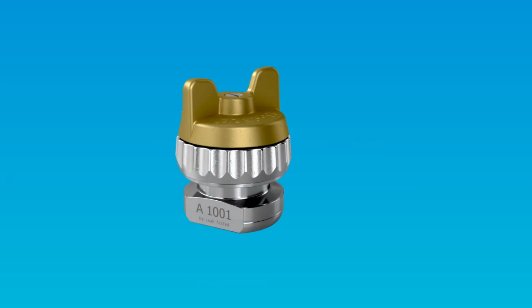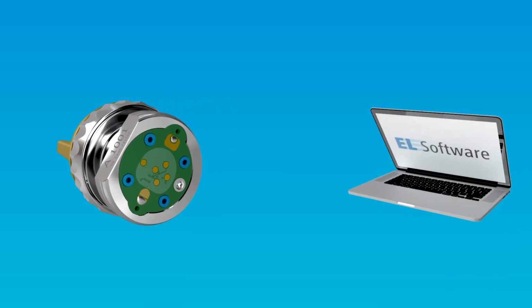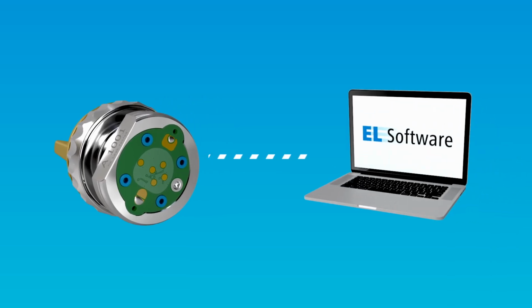The PAT button is a chip located in the cell base of most PAT series test cells. When inserted into a PAT tester, it transmits information to the EL software. The software then recognizes the cell tag and type and automatically assigns it to the correct test channel. The cell is also automatically registered in the EL software database to record historical data, such as the performed measurements or the composition of the contained cell stack. Therefore, it is a handy feature that saves you work.